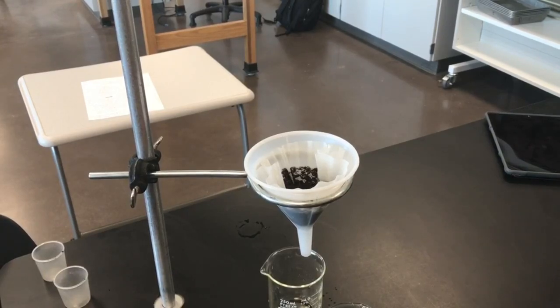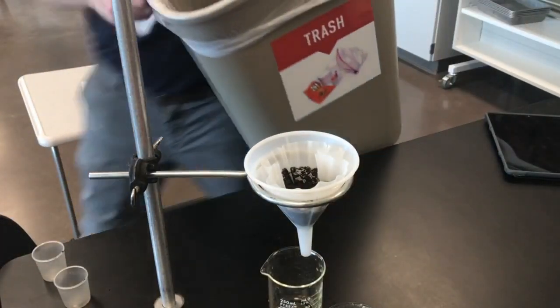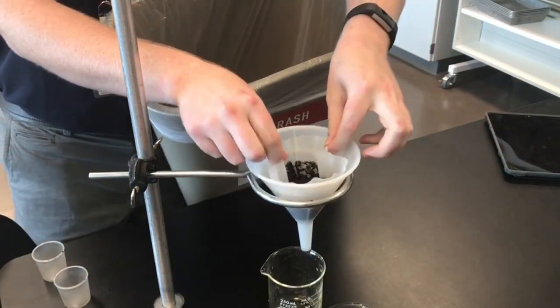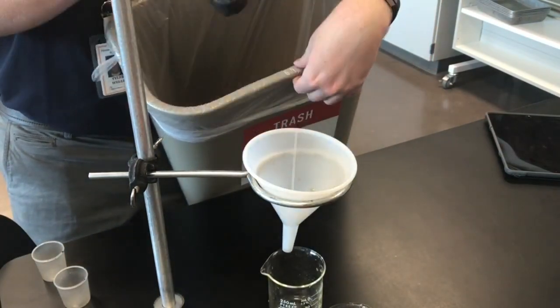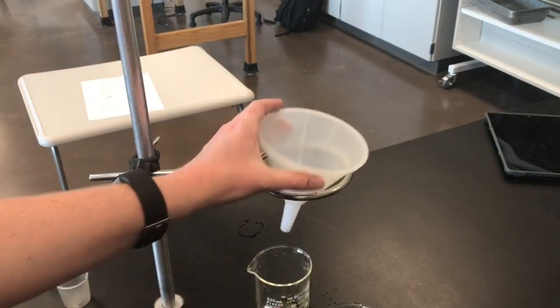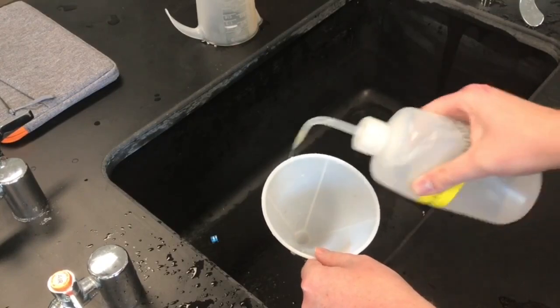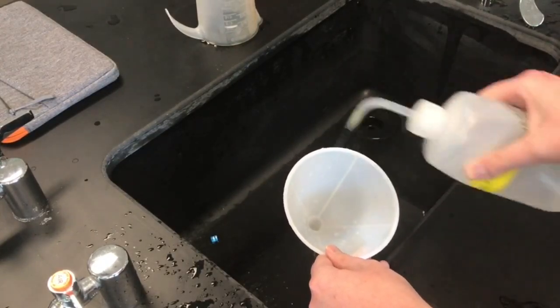Before we start the next part, you should fully dispose of everything that you used for part 1. So what I'm going to do here is throw away my solution. I'm actually going to bring over the garbage, and I recommend that you do this as well. To throw away my coffee filter, your funnel, we're going to rinse this out with deionized water here. So make sure you fully rinse out your funnel before you start the next procedure.